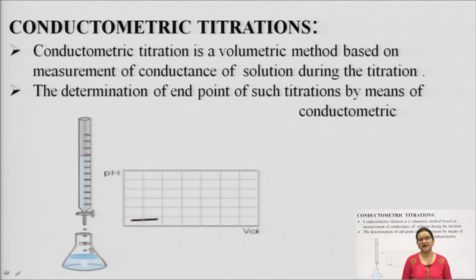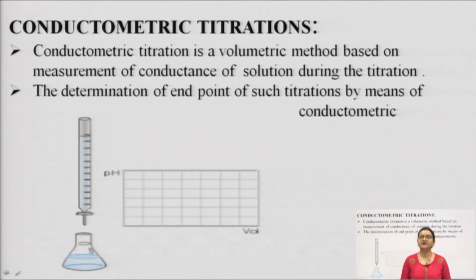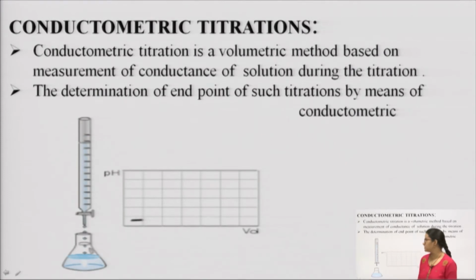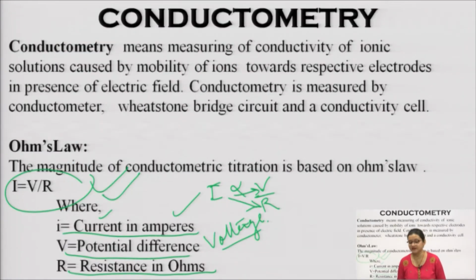The more charged ions inside the electrolytic solution, the more the conductance, as all of us know. As the conductance changes, the electrode potential changes. As the electrode potential V or voltage changes, it again changes our generated current. By this formula, Ohm's law, we can see that very well.